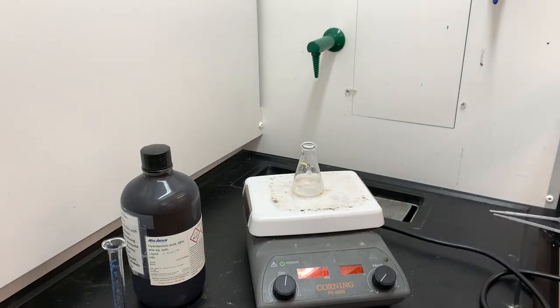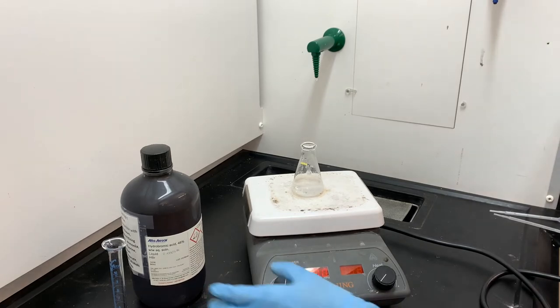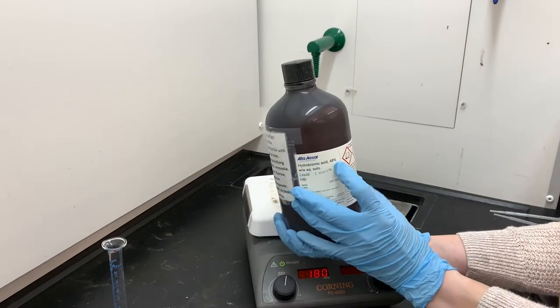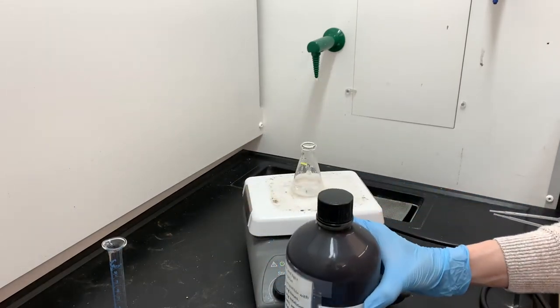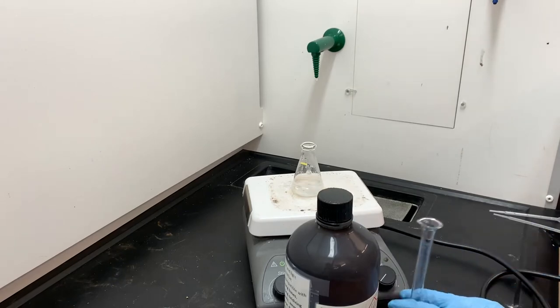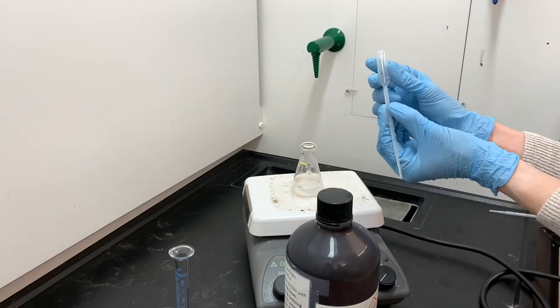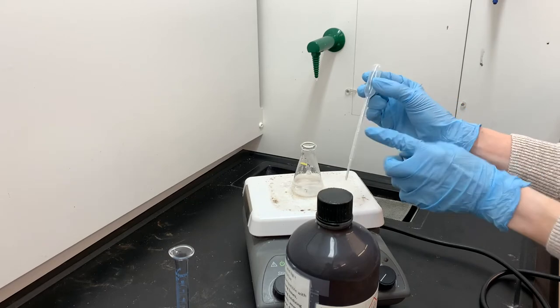And then the last ingredient is hydrobromic acid, HBr. I'll be using 48% hydrobromic acid, which is concentrated. We need about 2 milliliters. I do have a really teeny tiny little graduated cylinder, but I'm so bad at pouring into a graduated cylinder that I'm gonna use this disposable pipette.